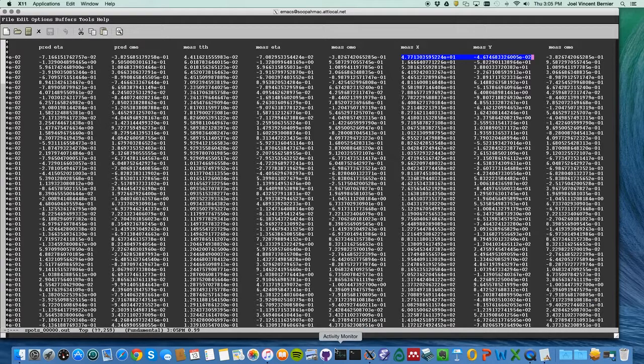So in a nutshell, that is how you do grain fits. And the same works whether or not you have a calibration pattern or you're fitting 1,000 grains at a time. There are just some tricks that we can discuss later about how you optimize things for many, many grains instead of just a handful of grains.